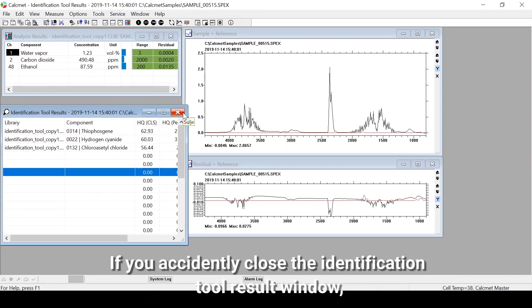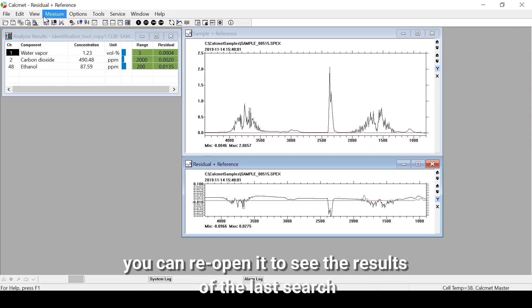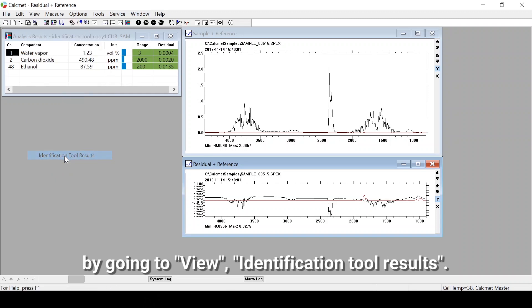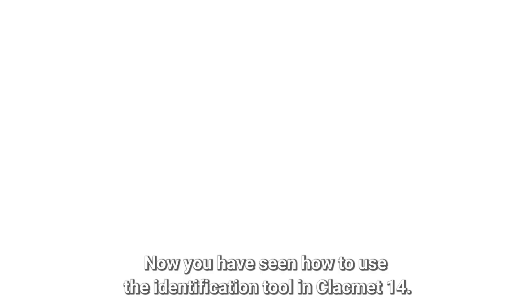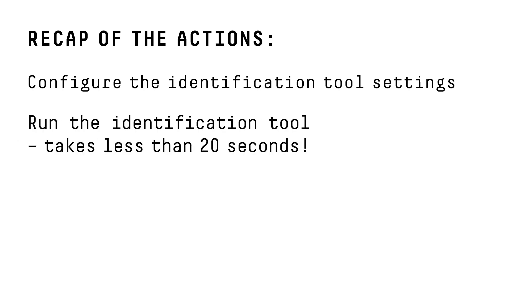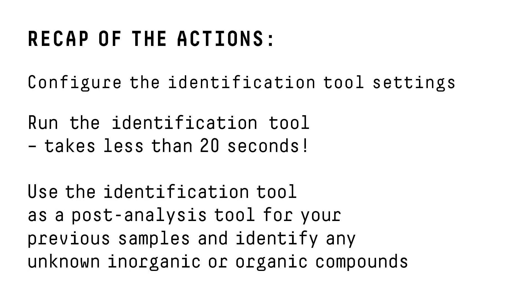If you accidentally close the identification tool result window, you can reopen it to see the results of the last search by going to View and then Identification Tool Results. As a recap, once you have configured your settings you can run the identification tool search in less than a minute by clicking Tools and Identification Tool, so you can quickly identify unknown compounds even when you are in a hurry in the field. You can also use the identification tool later as a post-analysis tool — you just need the sample spectrum of the sample you want to analyze.